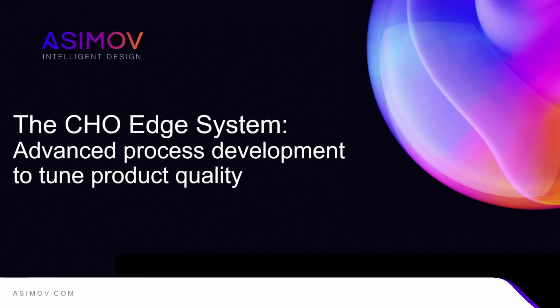Yep. So I'd like to thank everybody for coming today and for hearing about my talk on the CHO Edge system, where we're trying to do advanced process development to tune the product quality. When I first started in the industry, a common approach was just to screen as many clones as possible, and then to throw as many process levers at that clone as possible to get to the process that we need. What if there was a better way to do that?